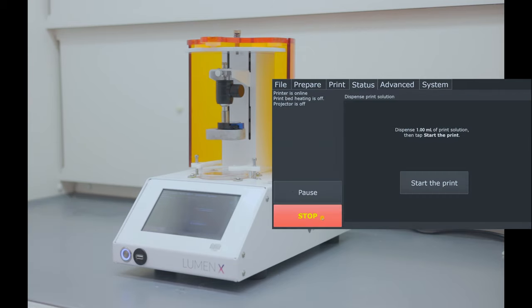Now, we are taken to the status menu. We can see the status of the printer, the print bed, and the projector.